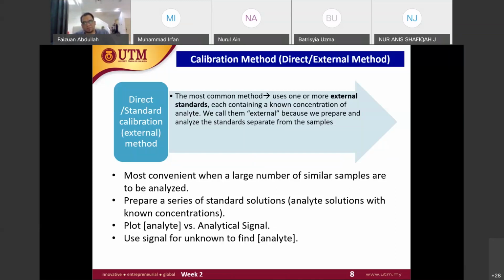In the chromatogram it is represented by the area. What is represented by the area of the chromatogram? Anybody? Right, never mind, we go first.